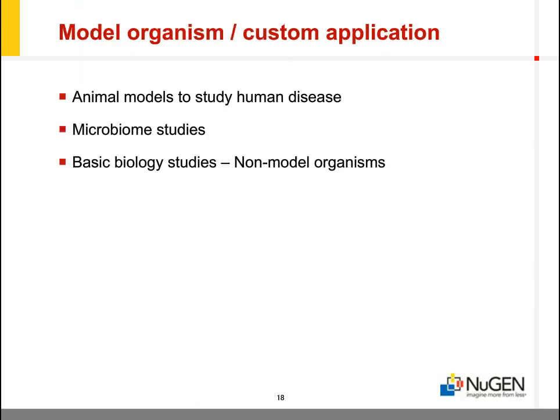The InDA-C-mediated transcript depletion can be quickly and easily customized to target uninformative transcripts from any organism. This can include specific model organisms that are used for studying basic biology or human disease, to whole microbiome studies of the human gut or deep-sea vents, as well as non-model organism studies used to study and identify novel biological pathways or processes.